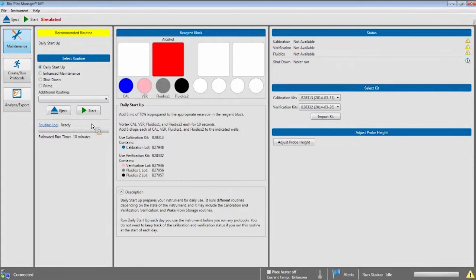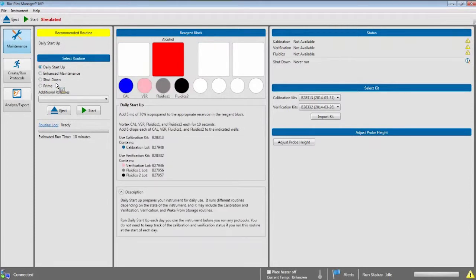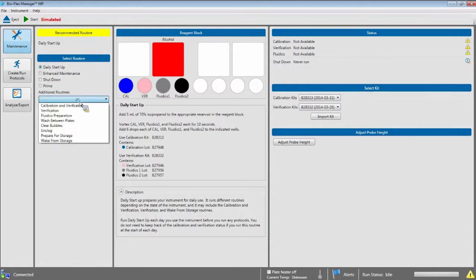In this column, you select the routines to run. At the top of the column, under the yellow bar, is the recommended routine to be run at this time. We always recommend running the daily startup when the MagPix is turned on for the day. In the Select Routines section, under the blue bar, you will actually select the maintenance routines to run. The four most common routines — startup, enhanced maintenance, shutdown, and prime — are listed next to radio buttons you can click to select. Underneath the radio button is a drop-down menu of additional routines that can be run with a startup or run separately as needed for maintenance or troubleshooting.